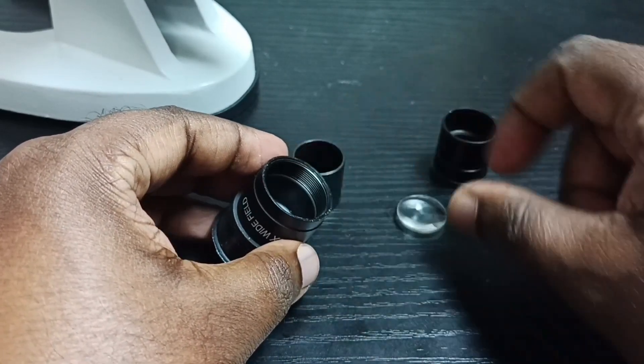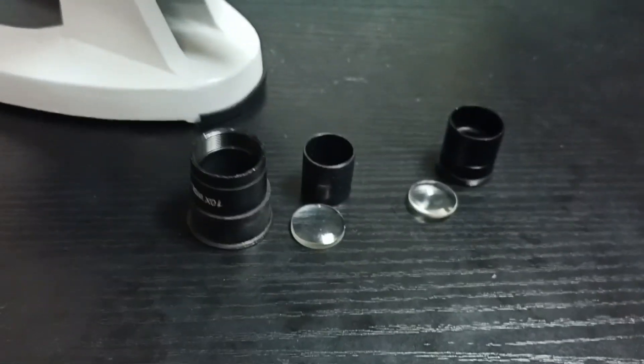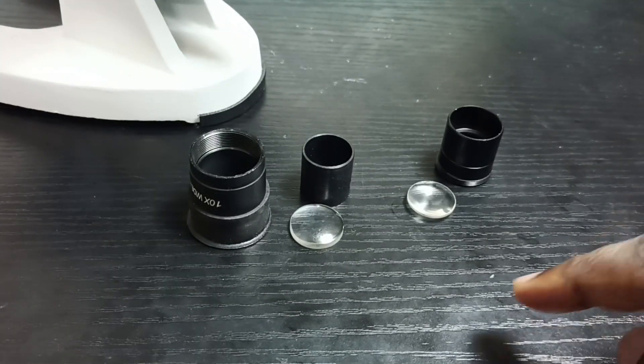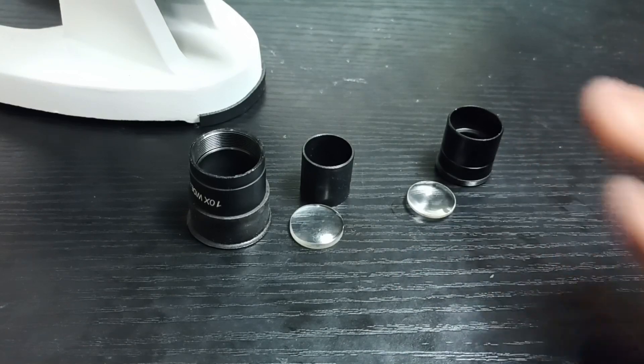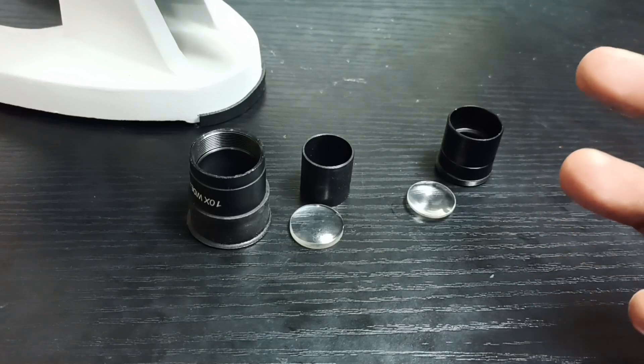There is one more lens — it has two lenses, see. We can clean these lenses using some cloth. We can also use some kind of cleaning liquid. After cleaning, I will show you how to put all these parts back.